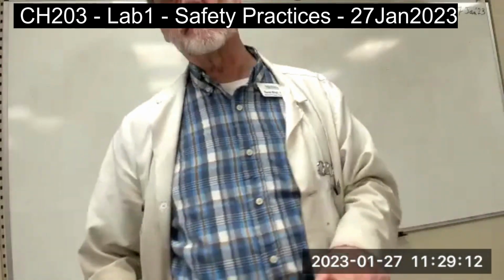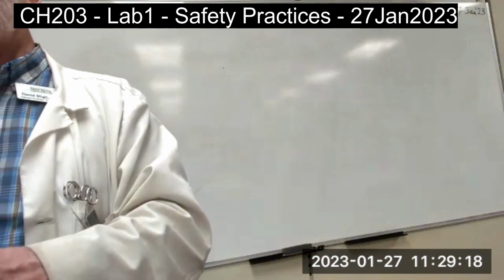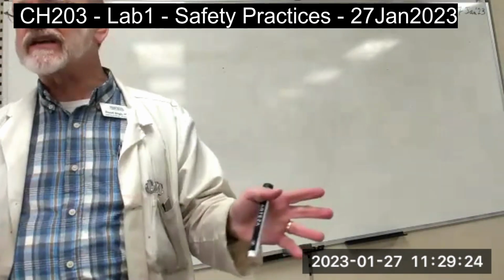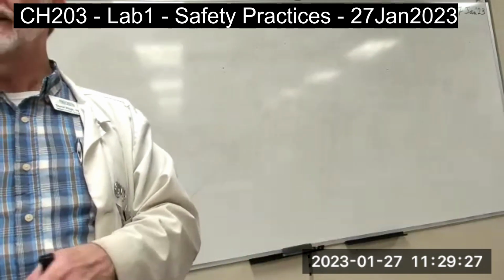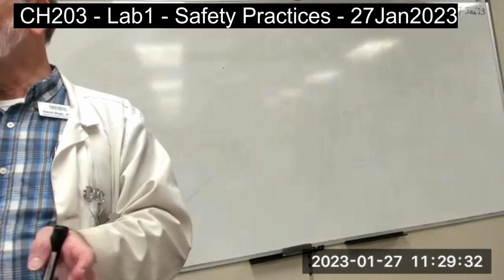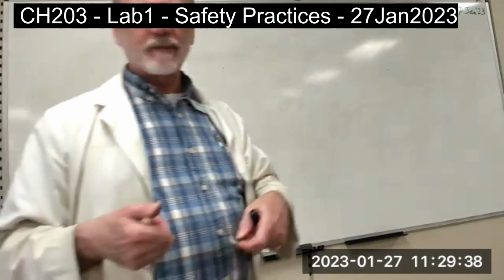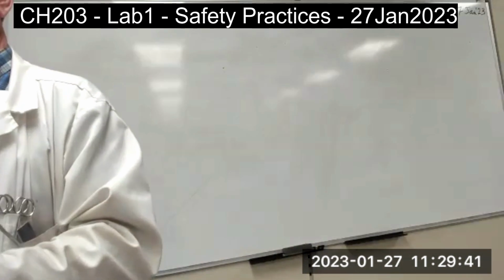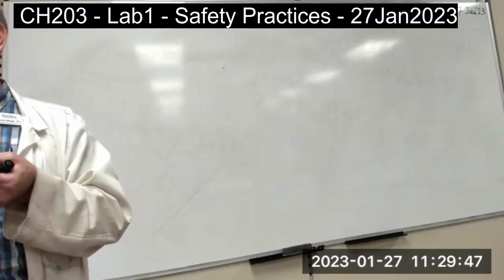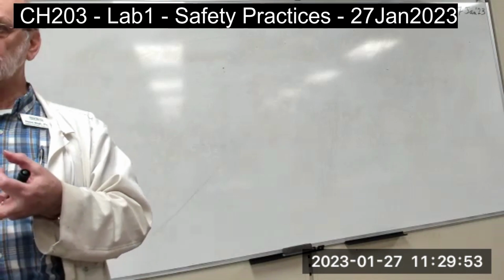If we're dealing with glass, be sure of two things. What's the temperature and where are you going to put it, right? If you've never put anything in it before, it's never been near a heat source, then you're pretty safe. You can grab it. But if it's been near a heat source, you want to be sure that it's cool before you grab it, or you have tongs to grab it with. Okay. So there are various ways that you can injure yourself in the laboratory. One is heat. One is flying objects. One is caustic materials, those that can cause chemical burns.